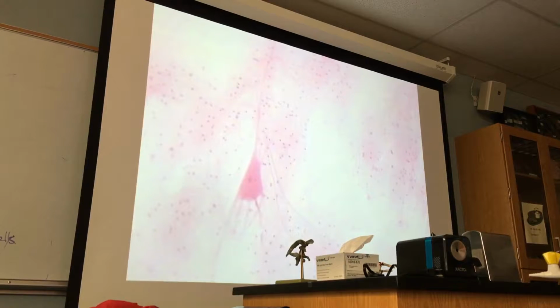Here, in the posterior pituitary, the axons that are the neurosecretory cells of hypothalamus. But there are other regions. Posterior pituitary contains the axons of the neurons whose cell bodies are located in the hypothalamus. But this is spinal cord. Understand? So it will make a synapse at the axon terminal with another neuron maybe. Figure that? With another neuron.